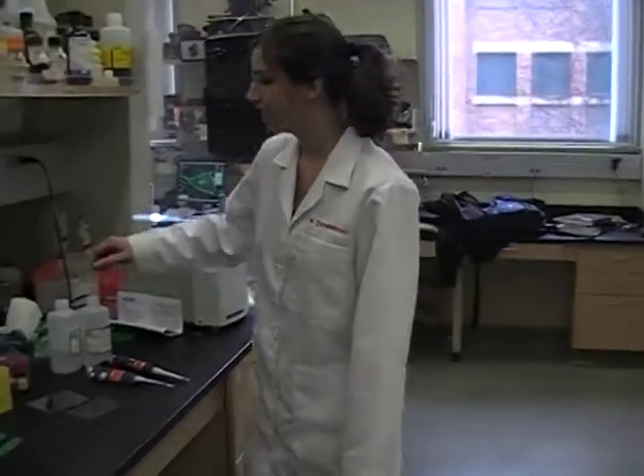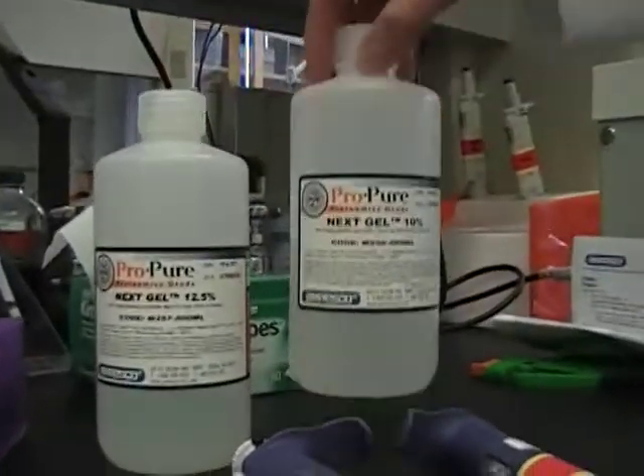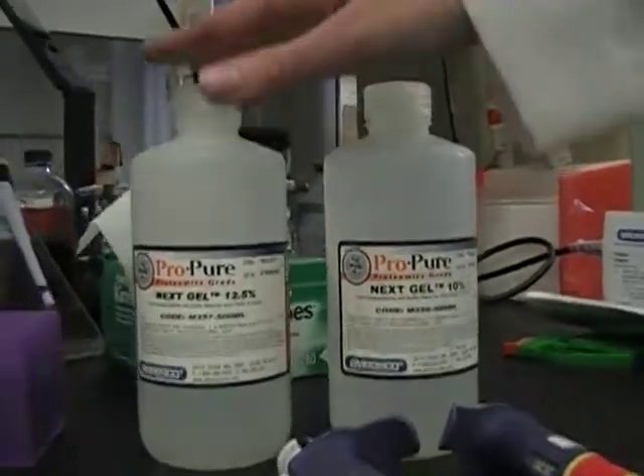Hi, I'm Margaret Zimmerman and in this tutorial I'll show you how to cast a NexGel. This lab has two different types of percentage of NexGel solution: 12% and a 10%. Which one you use will depend on what type of protein you're analyzing.